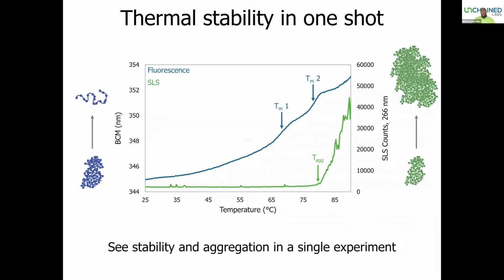As a reminder, all right, some of the raw data for the UNCLE consists of fluorescence. And so what you're viewing here is a denaturation curve where we're showing you an example of just 2 melting temperatures. The UNCLE can automatically assign up to 4 melting temperatures, right? And then you're also seeing concurrently, simultaneously being collected, the aggregation data, which measures essentially what happens when you go from a small, ordered, mostly monomeric form of your protein to an aggregated form of that protein. And of course, the protein can also undergo unfolding, and as it's unfolded, it then undergoes aggregation, right? Those 2 processes are possible.